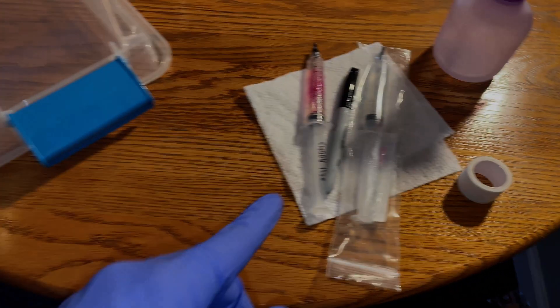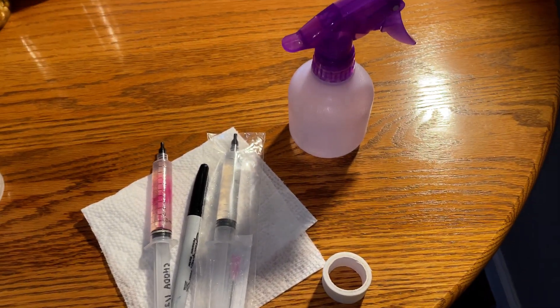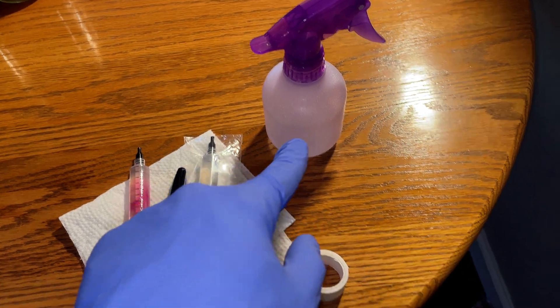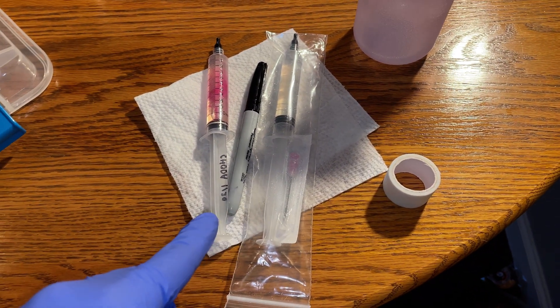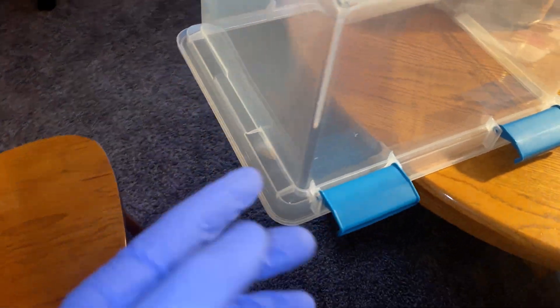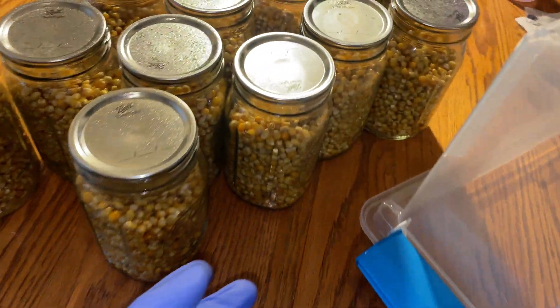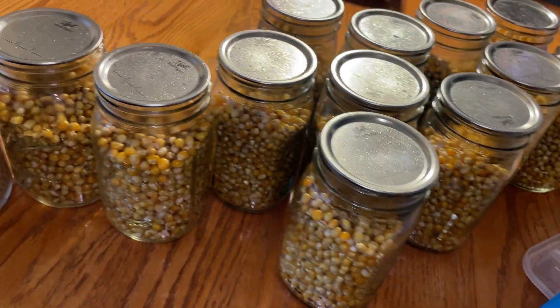This provides more surface area as opposed to putting just a chunk or two of agar into the grain jar, which in turn will colonize the grain faster. The materials you'll need to do this are: 70% isopropyl alcohol, tape, a marker, liquid culture, a SAB also known as a still air box, and some grain to inoculate. This time around I'm using popcorn for the grain.